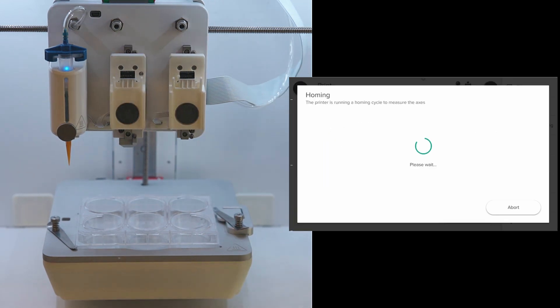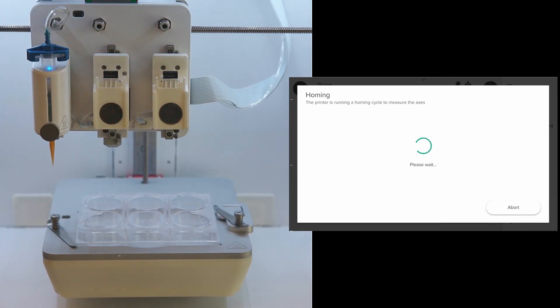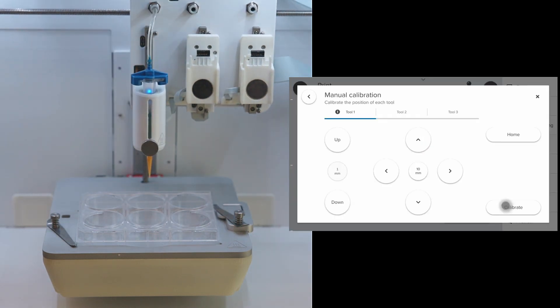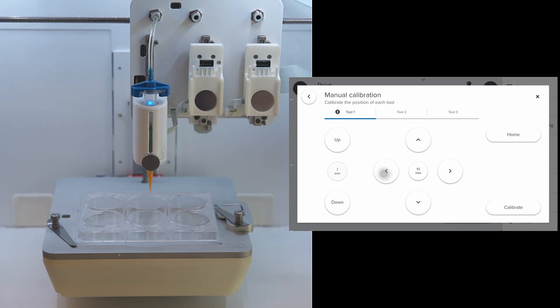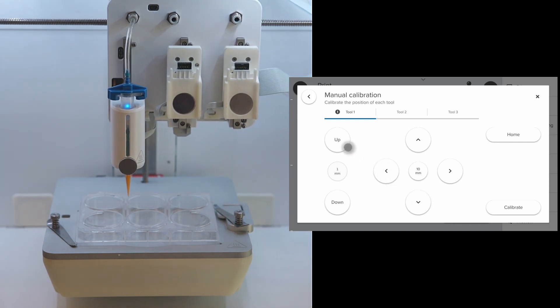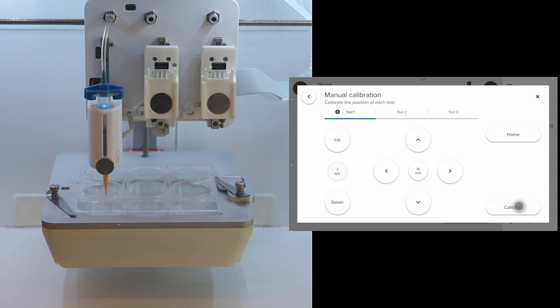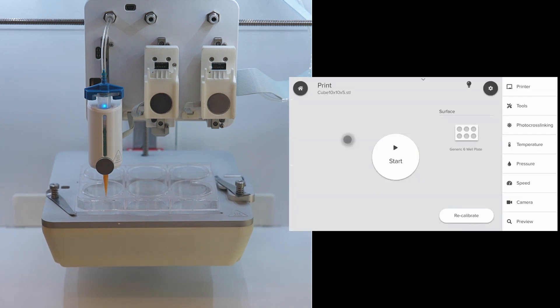A homing cycle is performed to measure the axes. Using these controls for manual calibration, we move the tip of the needle into the first well. Remember, the printhead moves along X and Y axis and the print bed moves along Z axis. When we click up, the print bed moves up. So make sure we have our step size appropriate. Once we find the calibration appropriate, click on calibrate and click start.